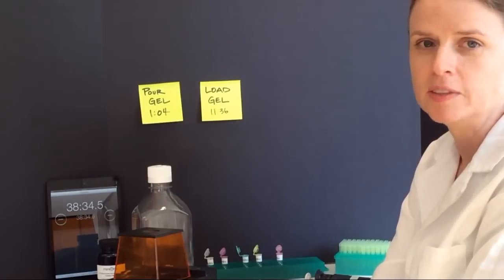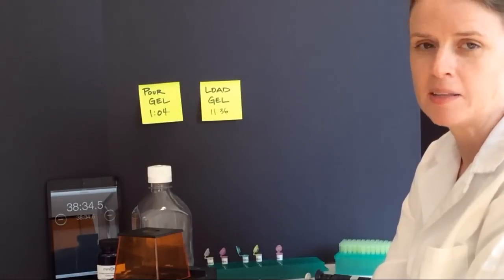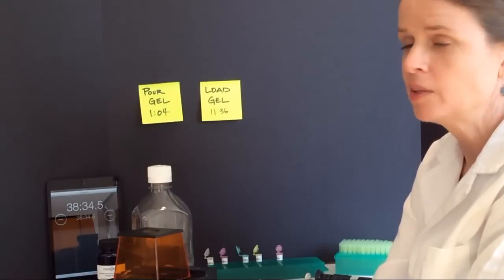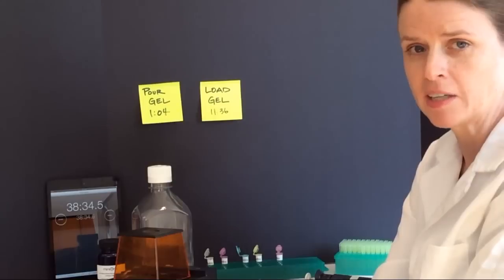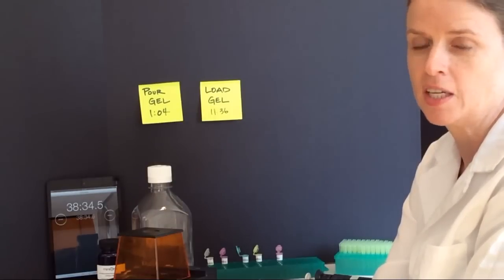I hope you found this video to be helpful and that you're able to see why I like the Mini One system so much. I really do think it solves many of the problems encountered by teachers as they try to incorporate gel electrophoresis and biotechnology into their courses.